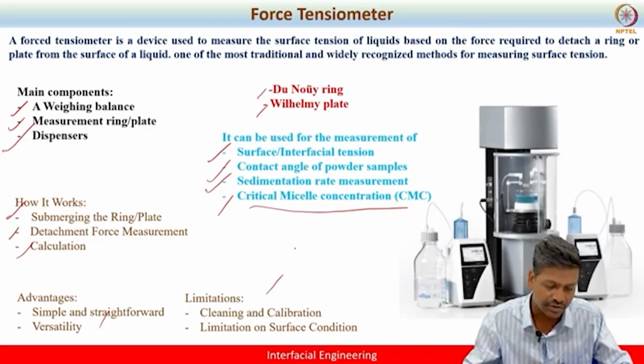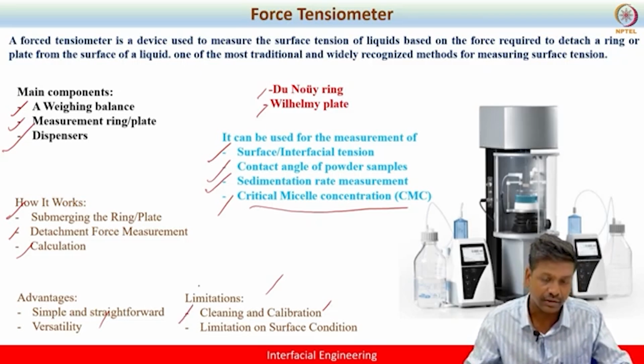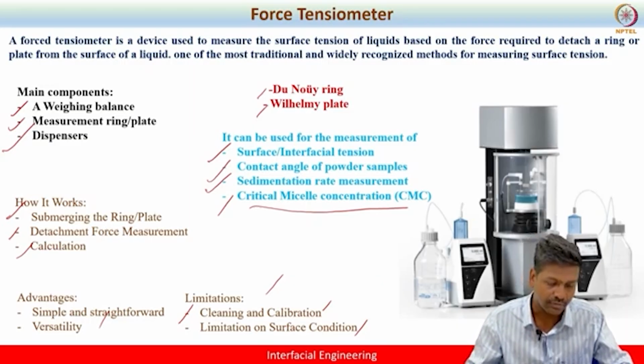Okay, but there are some limitations. You have to be wary of the cleaning and calibration always. That is the key, right? If you want to get a result with good accuracy, you have to deal with cleaning and calibration. And the other limitation is the surface condition. The surface should not deteriorate over time, so one has to always monitor the condition of the surface, right?